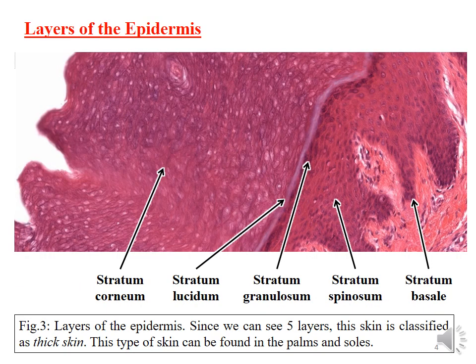So let's look at the layers of the epidermis. First, here we have the deepest layer. This is the stratum basale. Then after it, we have this part here.